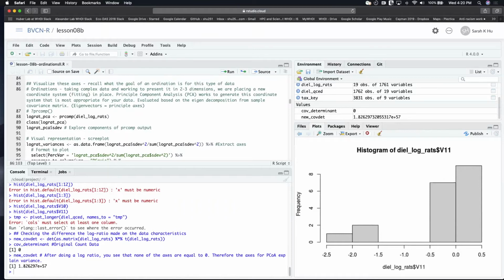So you have to multiply everything by itself. Then you do a decomposition step in R, which I cannot explain exactly, but the point of those two steps is that first you're measuring all the variability among all the random points in your data, points being samples, and then the decomposition gives you the eigenvalues, where you are able to see that variance. Does that answer your question a little bit?